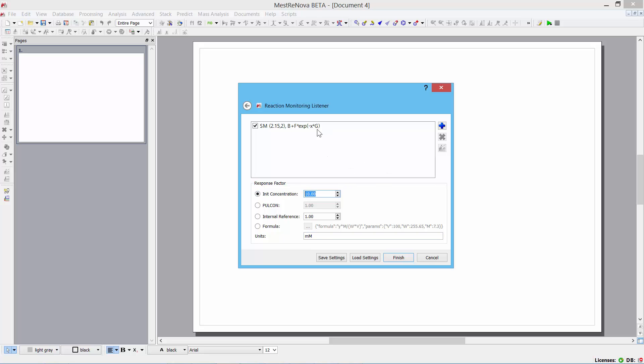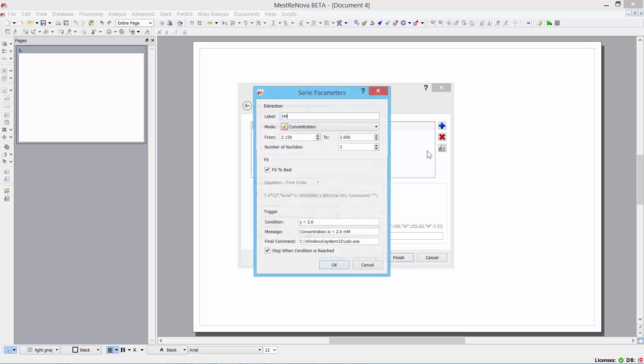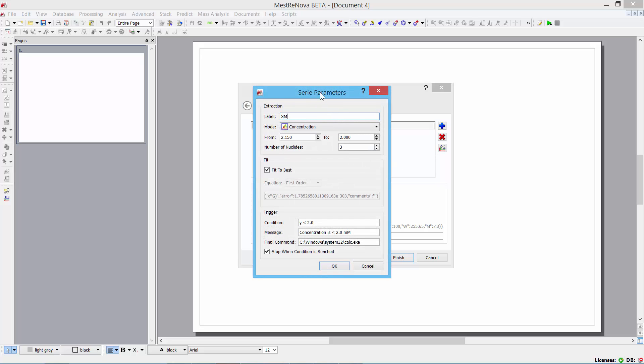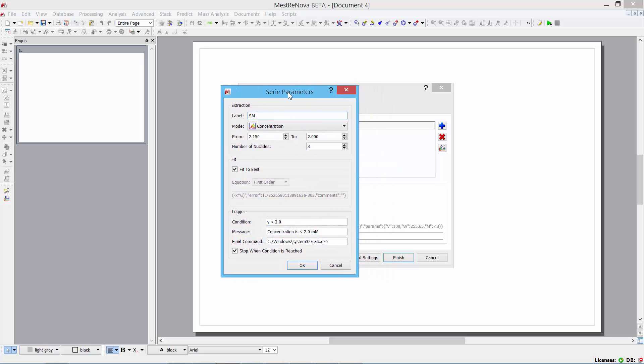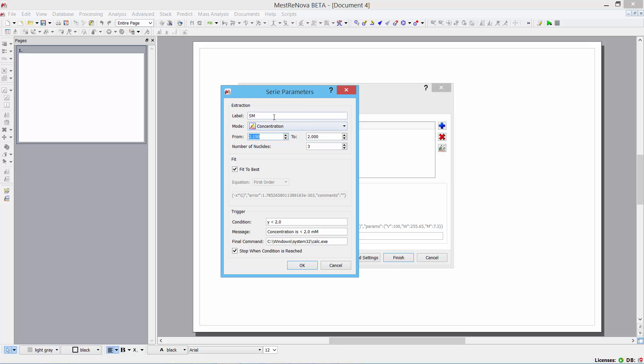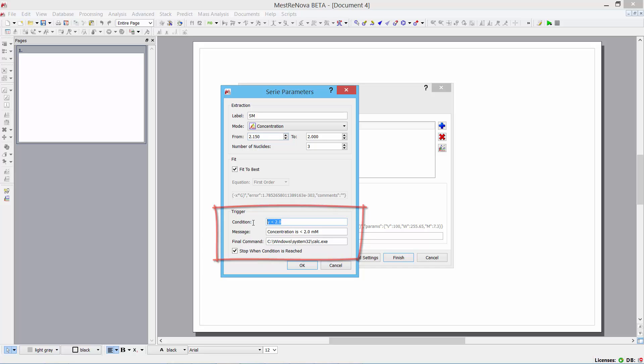And in this top portion here, I can specify triggers. And this is for one particular series. I'm looking at this particular portion of the spectrum from 2.15 to 2 ppm. And I'm doing a best fit to the data automatically. And this is the trigger section over here. So, I'm specifying that the y value, which is the concentration, should be when that is less than 2. Then a message appears over here.